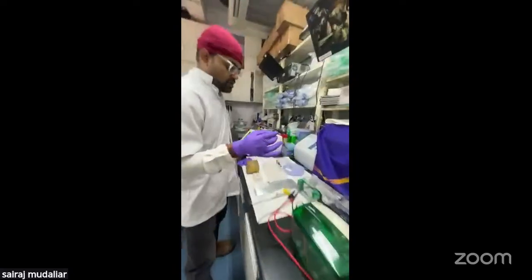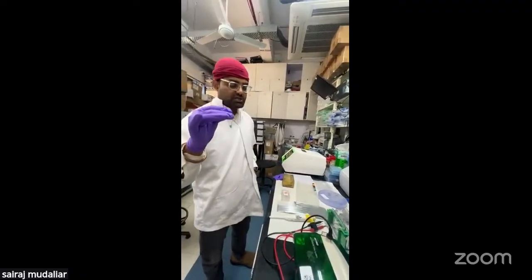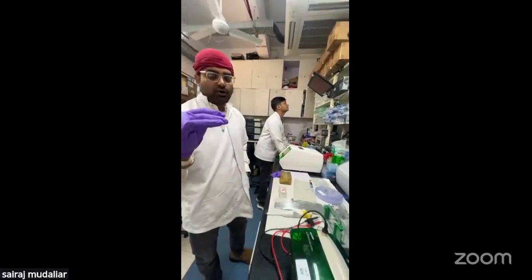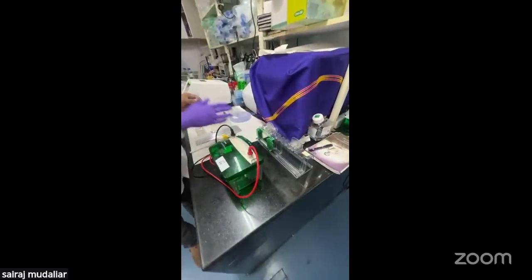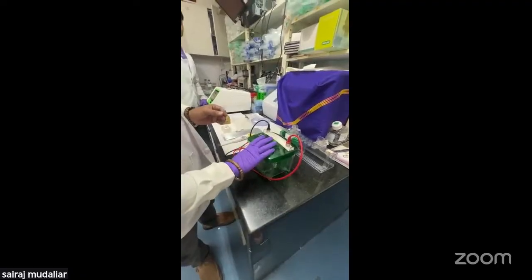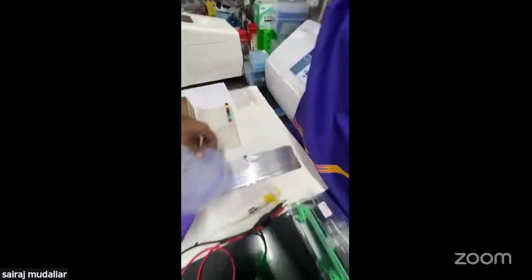Once the tissue sample has been collected, we can do a quality check. In the quality check, you can do an SDS page. You can find this is the apparatus where we cast the gel. Once the SDS page gel has been cast, you run your samples in the running apparatus. And once the samples have been run, this is how the gels look.